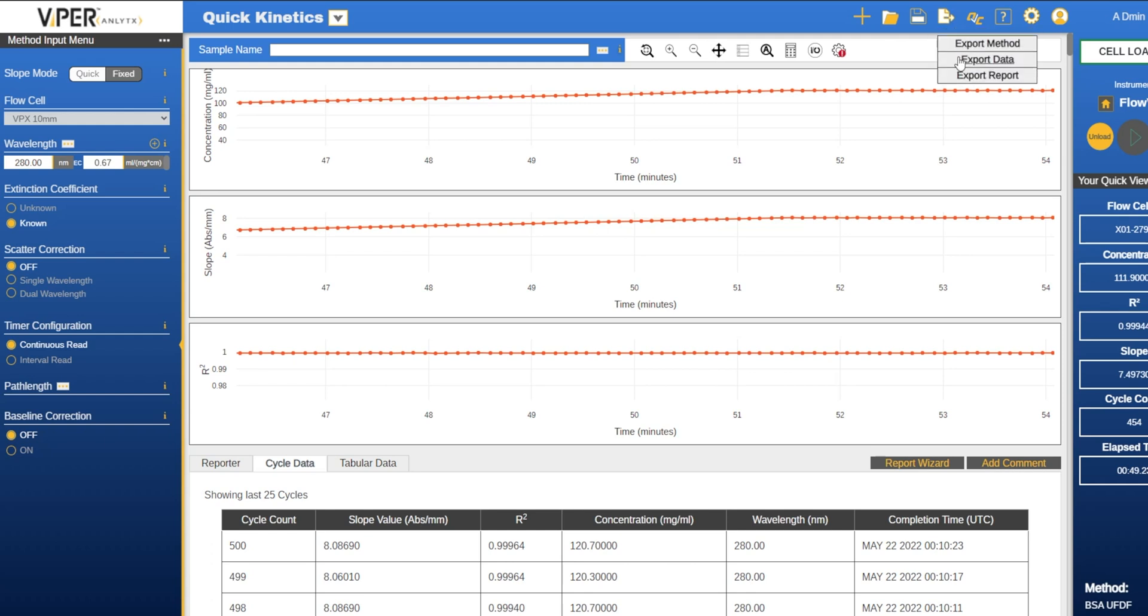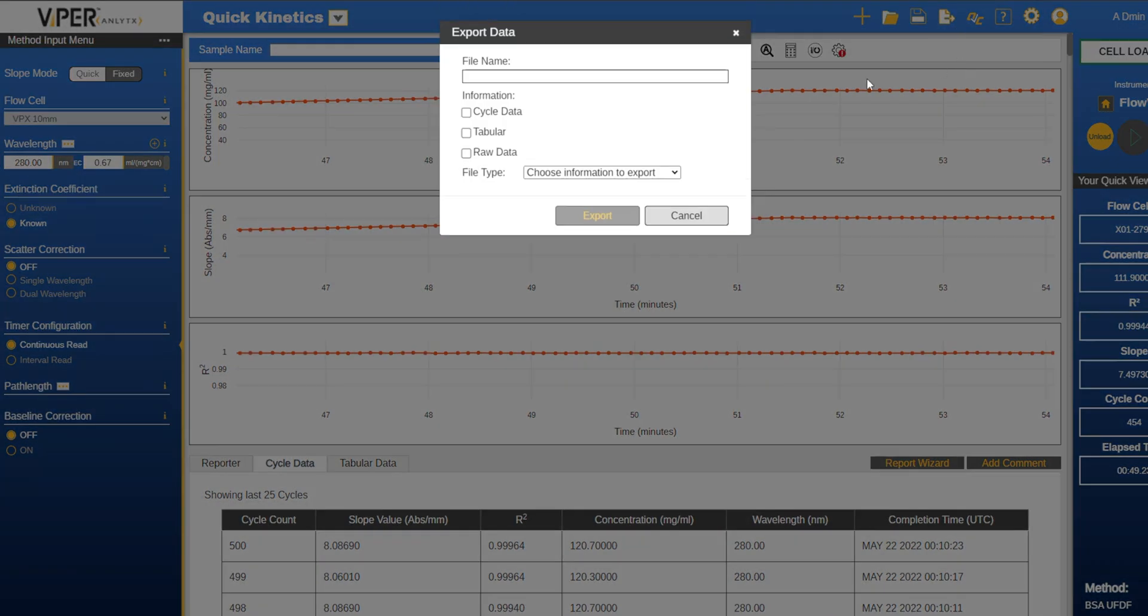To export the data click the export tab and then select whether to export it as a CSV or Excel file.